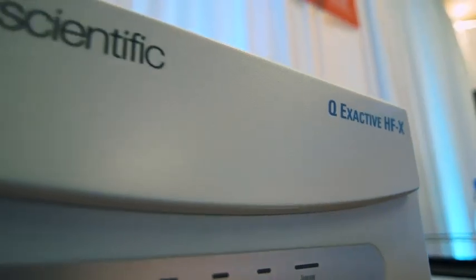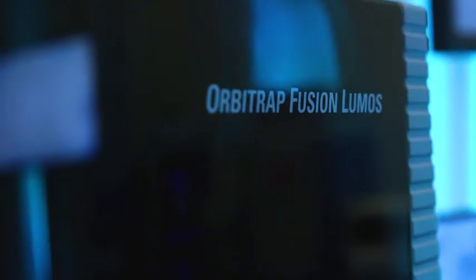Along with the data processing tools that we're getting for Compound Discoverer and the other software from Thermo, as well as the spectral resources from MzCloud, it's really nice to then seamlessly integrate that with the high-res MS instruments that have come out just in the last few years. So for example, the new high-field Q Exactives, as well as, most critically, the Orbitrap Fusion and the Orbitrap Fusion Lumos that have internal calibration.